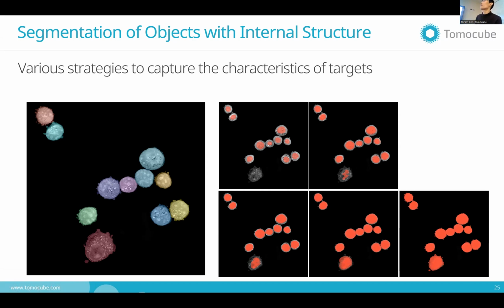In this case, we use watershed inside the process, but the basic watershed approach, which takes the boundaries and then separates them by the simple watershed algorithm, doesn't work in this case because it's three-dimensional. But if we do not make this kind of divided approach, then in most cases simple watershed did not work.